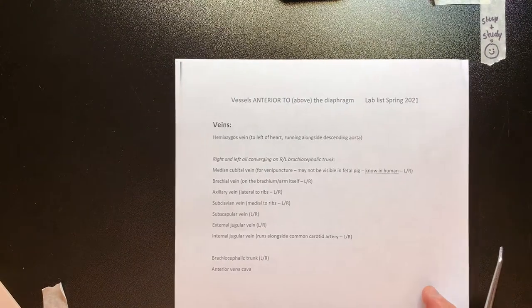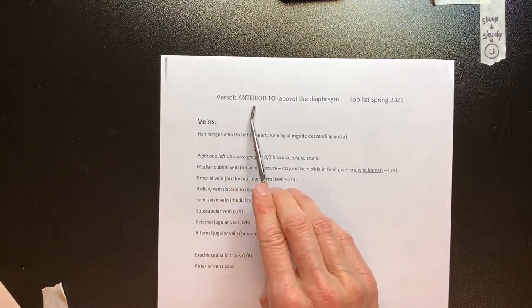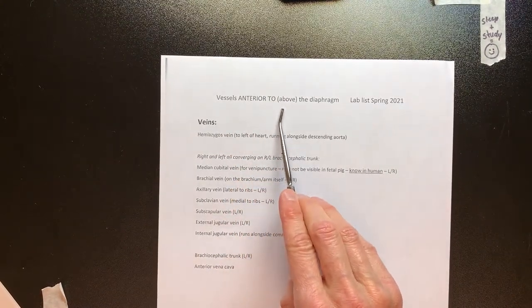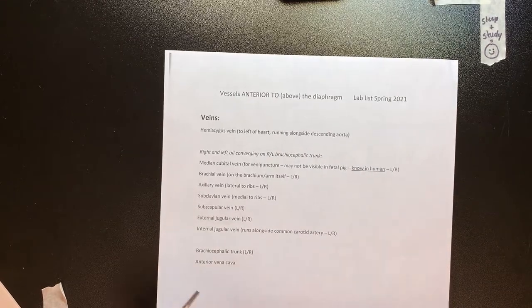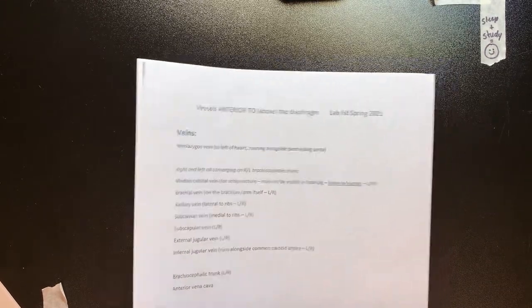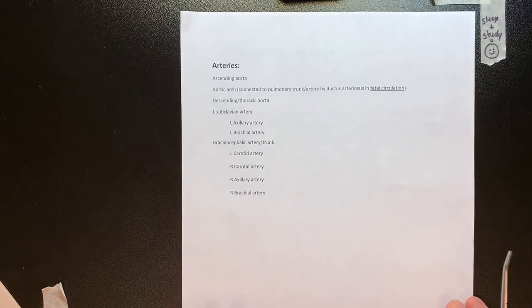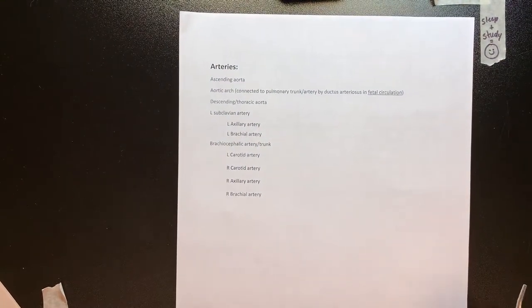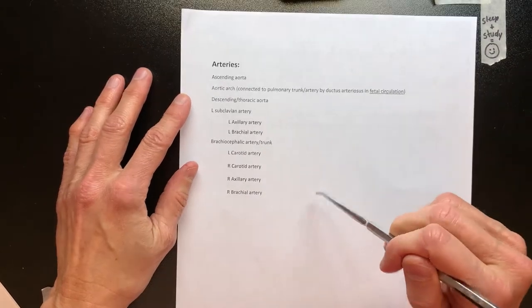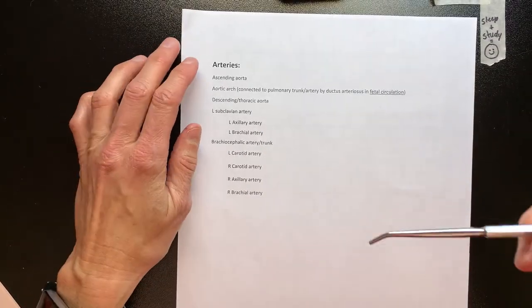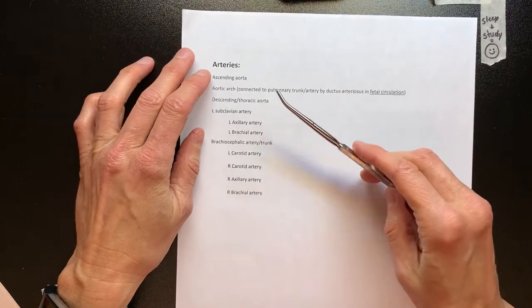Let's review the arteries that are above or anterior to the diaphragm. The list we're using covers vessels anterior to or above the diaphragm for the lab list of spring 2021. We've done the veins in another video, so now let's do the arteries. We'll be going from the heart out, because that's the direction of travel for the arteries.